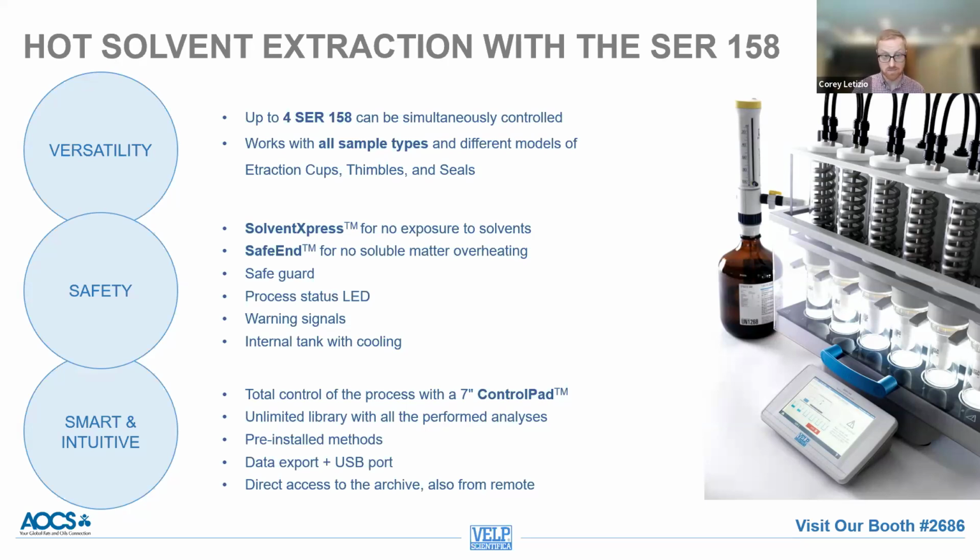Like I mentioned, that control pad, you're able to completely control the instrument through this control pad for analysis times, data export, and things of that nature. We have many pre-installed methods as well as the ability to customize methods. And you have direct access to the archive of your data, also from remote through our Hermes cloud connectivity, which I'll talk about here shortly.